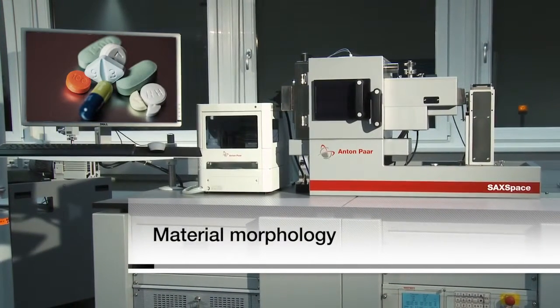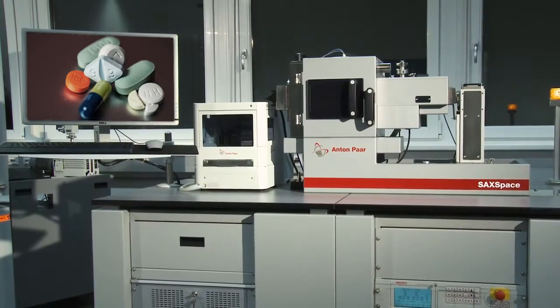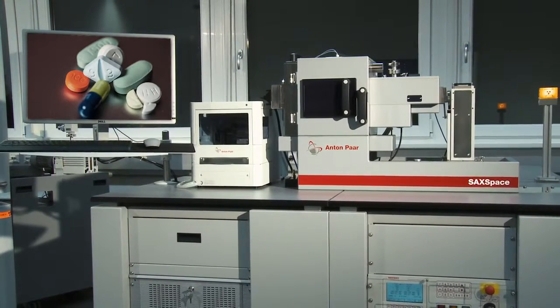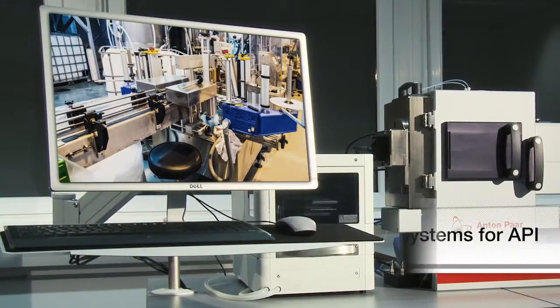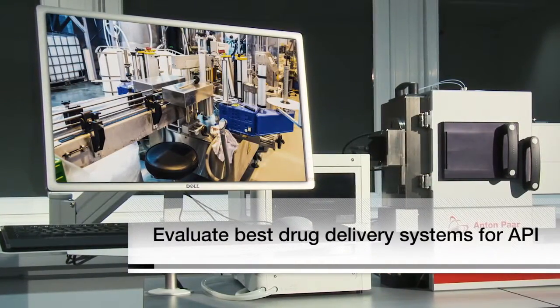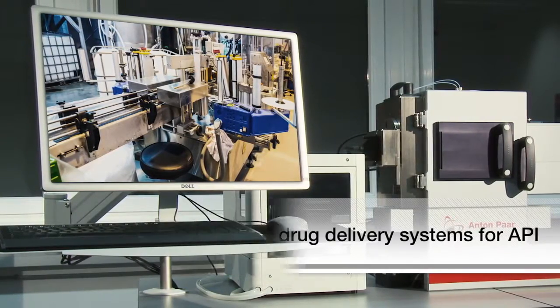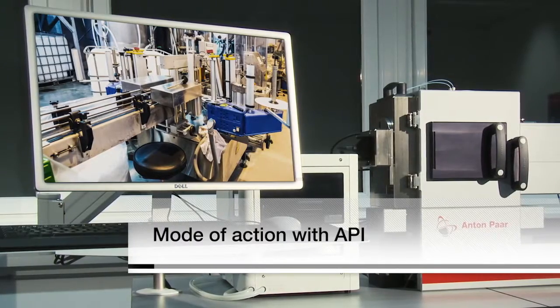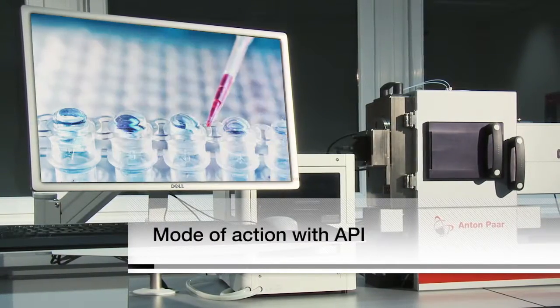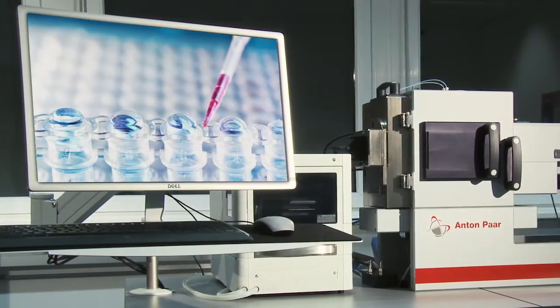In research, SAXS is employed to evaluate the best drug delivery systems for active ingredients, to investigate liquid crystals and biological membranes regarding their mode of action with the API, and to determine emulsions and formulations as drug carrier systems.